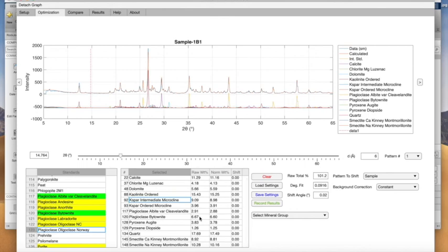All right, so let's look at this. I'm going to look at my fit. Like I said, below the analysis area, some of the peaks for the clays are more variable, so we want to look there, especially for sharp peaks. Those tend to be less variable, but we want to make sure we have those covered.